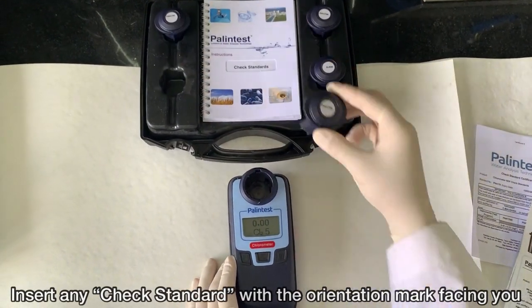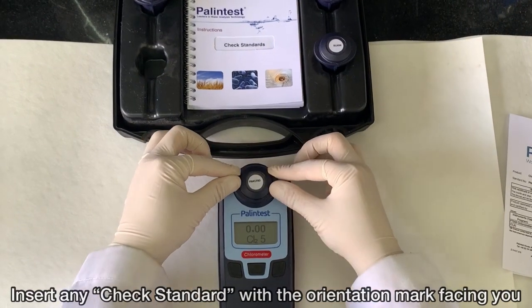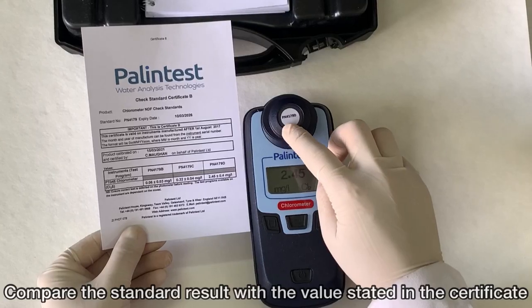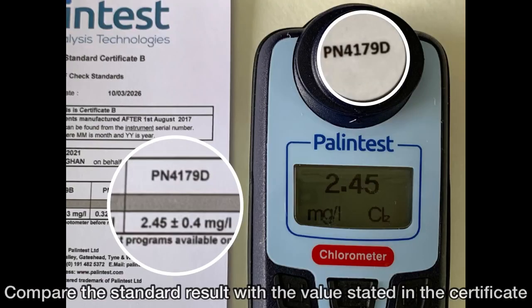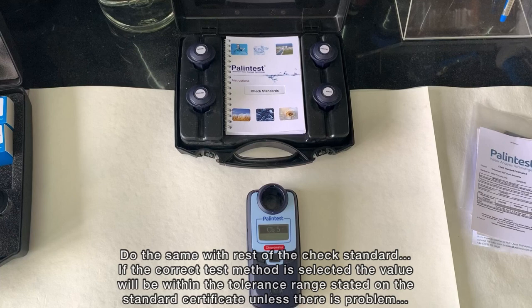Insert any of the check standards with the orientation mark facing towards you, and take the reading by pressing the read button towards the right side of the meter. Compare the standard result with the value stated in the certificate. Do the same with the rest of the check standards. If the correct test method is selected, the value will be within the tolerance range stated on the standard certificate unless there is a problem.